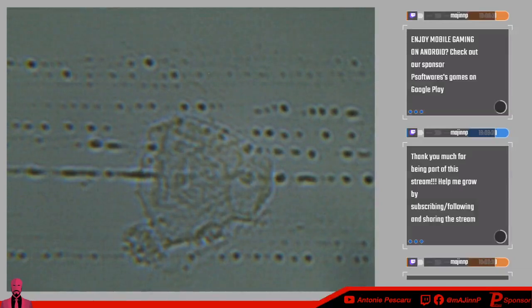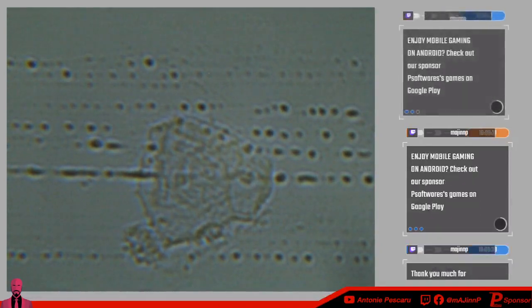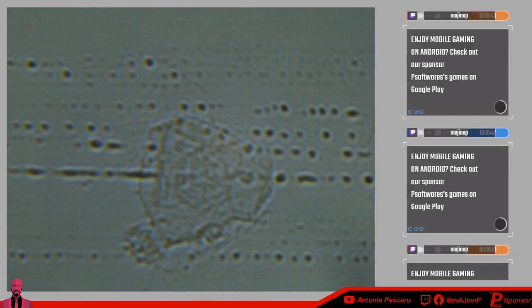And so, as I was saying, what's really interesting about buccal cells is that they're like the most basic living organism of your body to look at. You can easily view them under the microscope, and it's so interesting because your body is made up of tons of cells. Granted, they're not the same cells because each one of them has a specific function, and the way that works is that each cell that has a specific, let me start from the beginning.